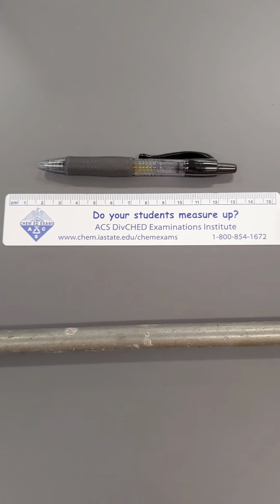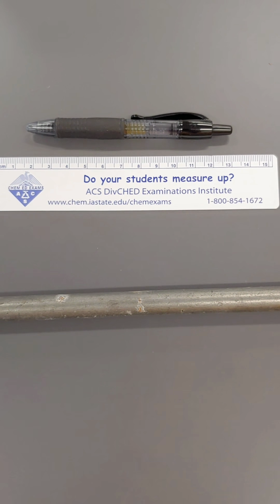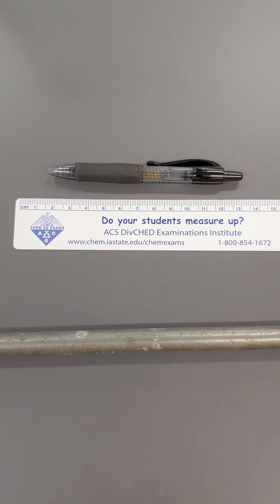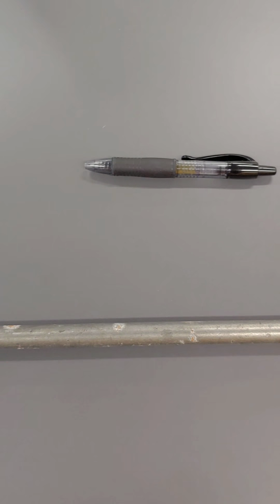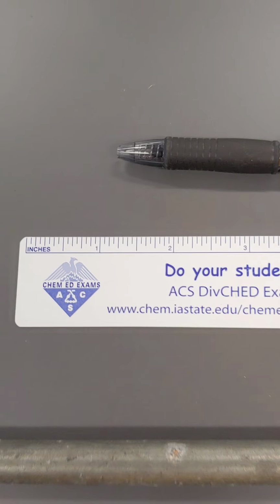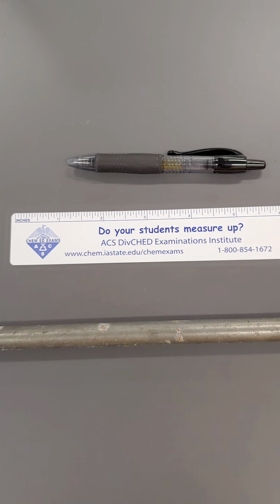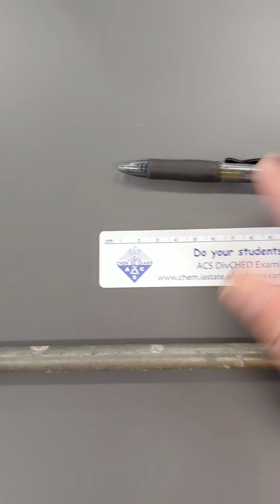All right, so here is the pen, and as you can see, I've got a ruler down there from the American Chemical Society. This side of the ruler has centimeters, so that's our metric side. If I were to flip that over and use the other side of the ruler, then you can see that it has inches. But since we're in a science lab, we don't use inches, so we're going to flip that back over and use the metric system.